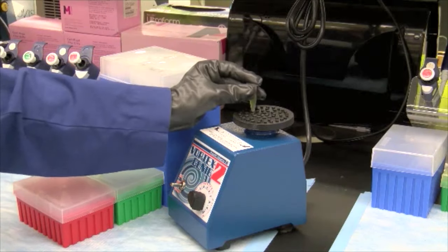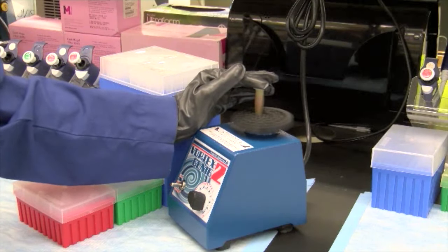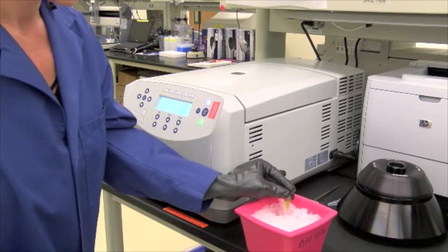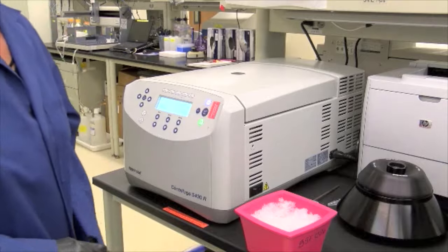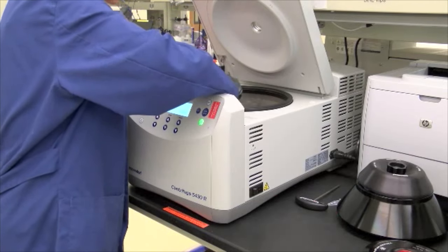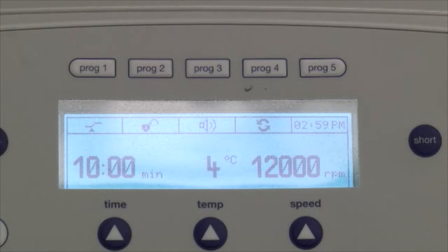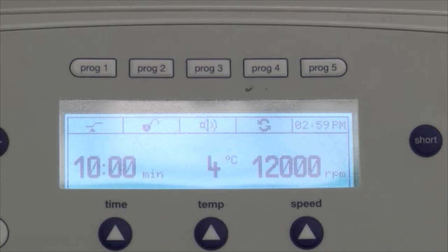So now we're going to vortex a little bit. And now we're going to incubate on ice for 5 minutes. Now we're going to centrifuge for 10 minutes at 4 degrees and 12,000 RPMs.